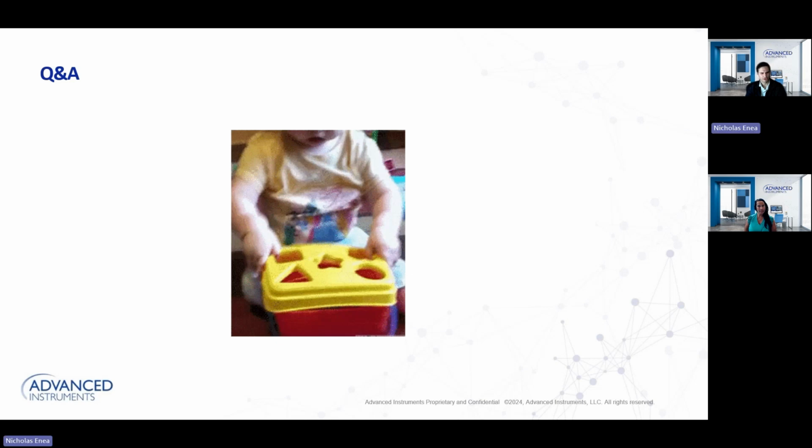So maybe, Tracy, could you give a little bit more color to that question? Tracy asked, just after you decide that you can write it into your policies, maybe a little more context there. I think what she's saying, Nick, is that whatever you decide for your tolerances, make sure that your SOPs and your policies reflect that. Sometimes people get very optimistic and set really tight tolerances.